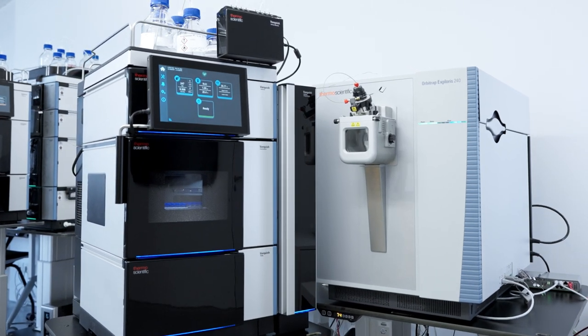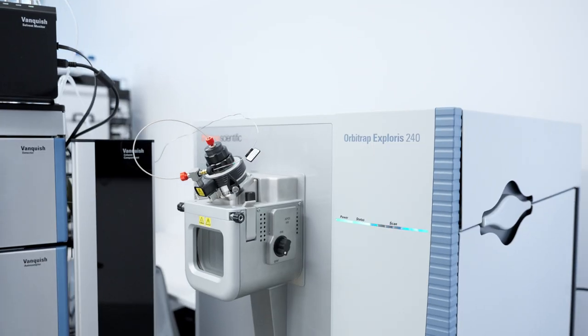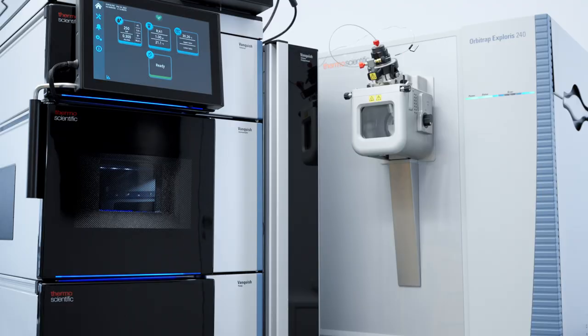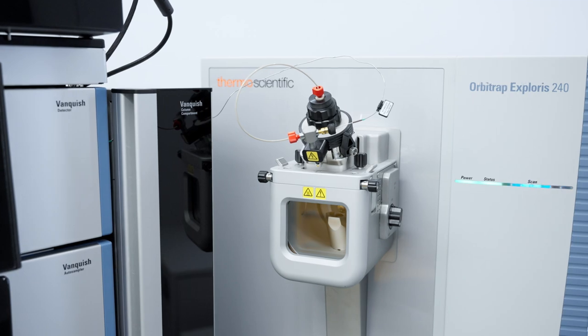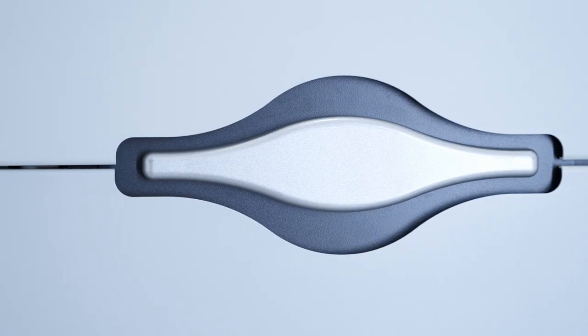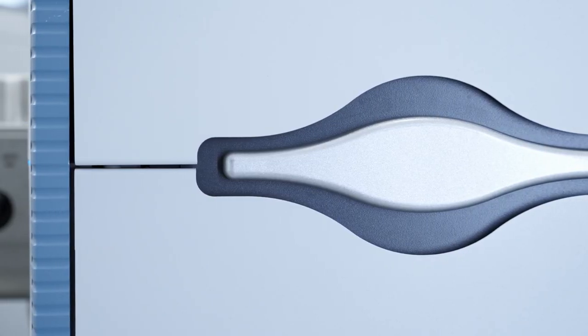When performing challenging sample characterization, the VanquishFlex UHPLC system seamlessly integrates with the industry-leading Thermoscientific mass spectrometry portfolio including single quadrupole, triple quadrupole, and Orbitrap technology.